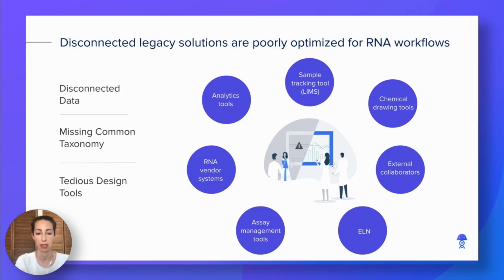Data is disconnected by living across multiple systems, so contextual insights are never surfaced. Time is wasted transferring data, and the process is error-prone. This current ecosystem is not efficient or scalable. Solutions that focus primarily on chemistry workflows also struggle to model hybrid chemical modifications to large biomolecules. And solutions that use the commonly available open Helm editor are also not intuitive for biologists.